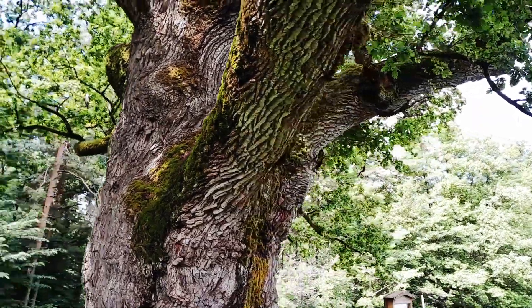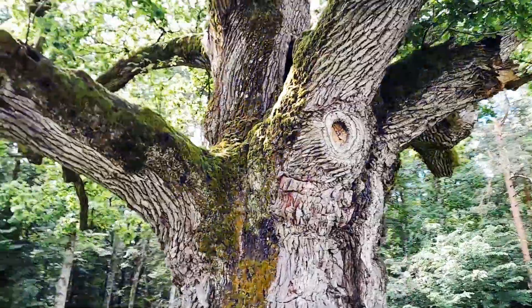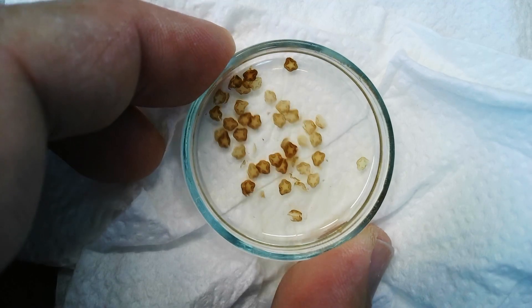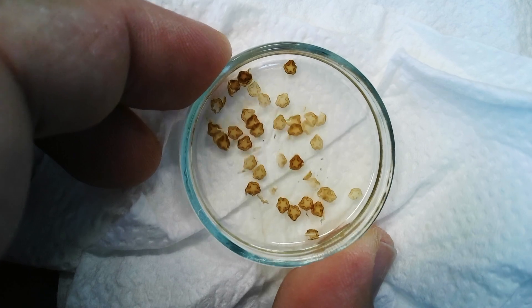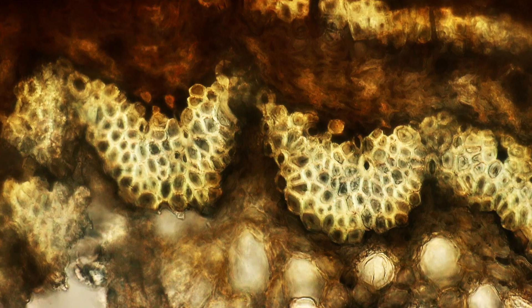I'm going to divide this video into several chapters. During the first part I want to dedicate time to the tree itself. I'll then be showing you in the second part a little bit of specimen preparation - I'll have prepared the wood of the tree - and then last but not least in the final chapter we're actually going to have a look at the piece of wood under the microscope.